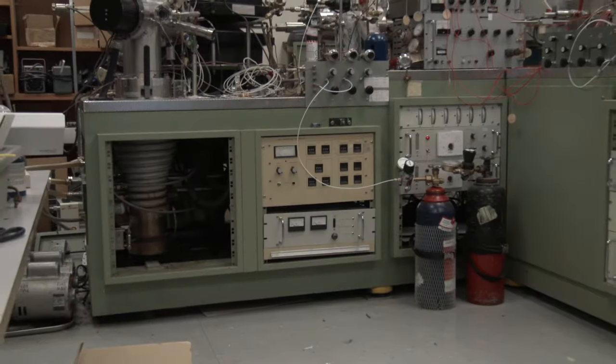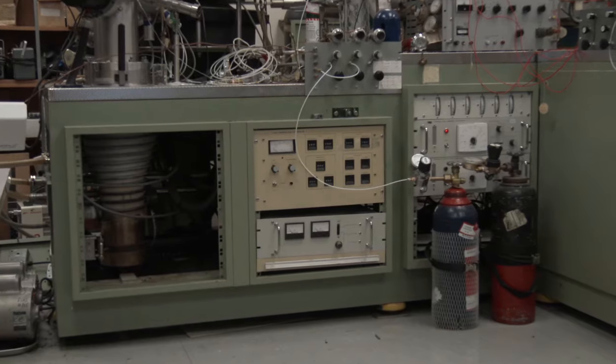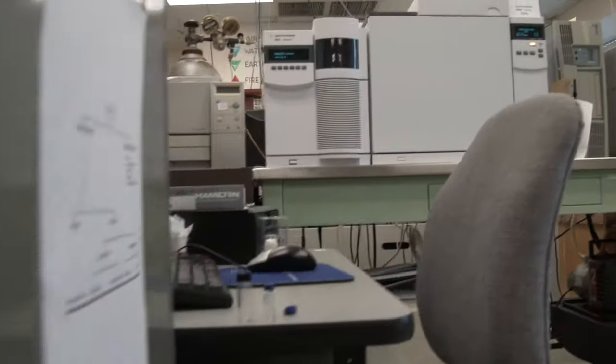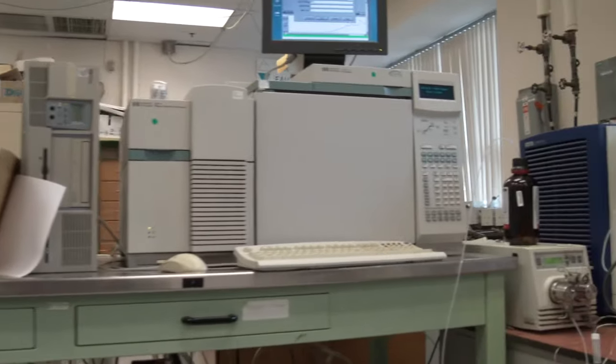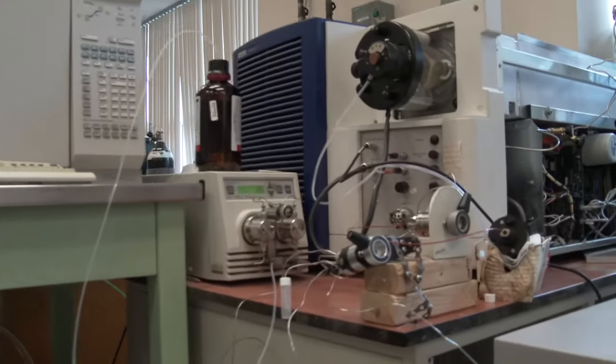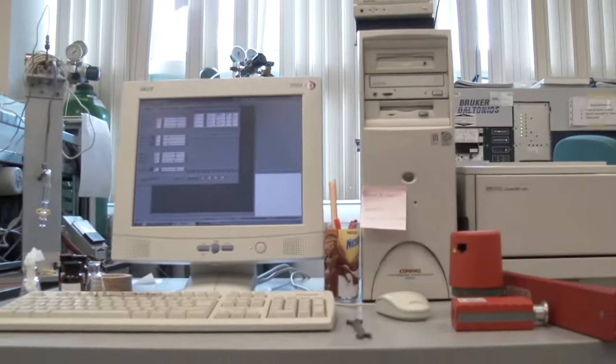John stands before the present-day Kratos Concept magnetic sector mass spectrometer. A mass spectrometer is, in essence, a very expensive weighing machine. It does not weigh grams or milligrams of stuff—it weighs atoms and molecules. To be able to do this, we first have to remove all the air from inside the experiment; otherwise, all we would weigh is air.